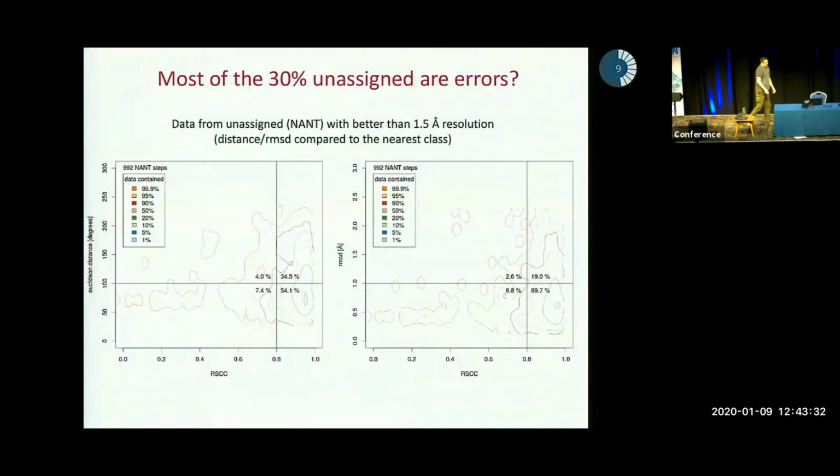So then, similar plot, but for the unassigned, for the outliers. So in the torsional space or in the Cartesian space, you can see that majority of the data is here, but it's a bit farther, so more than 0.5 angstrom. The left part, at high resolution, we can again ignore, it's relatively small. This is a result of one of the 18 atoms we are using of the backbone is basically not in the density, and when you average it, it goes there.